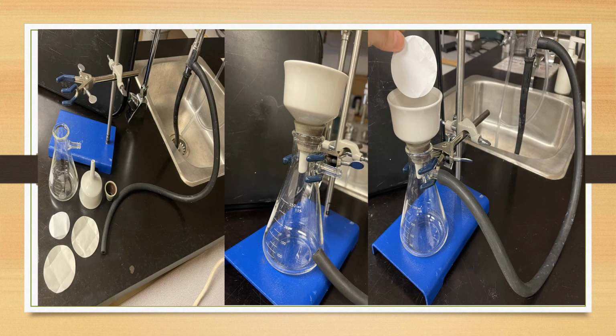This slide shows how to carry out a vacuum filtration using a water aspirator. Clamp the Buchner flask to the ring stand using a tri-prong clamp. The tubing connects the side arm of the tap water to the side arm of the flask, then add the filter paper to the funnel.